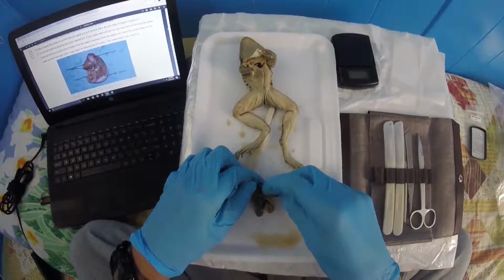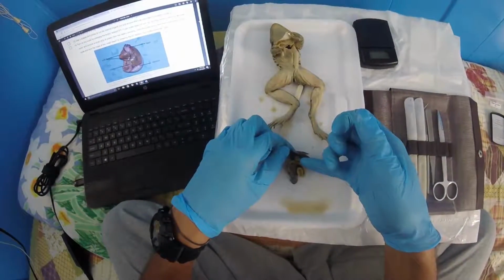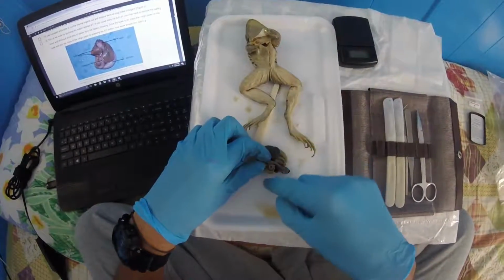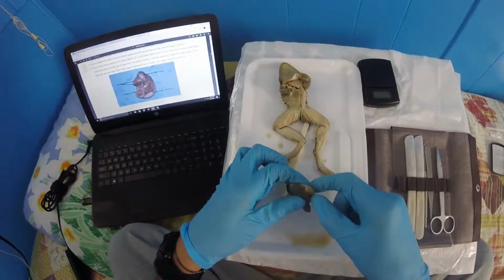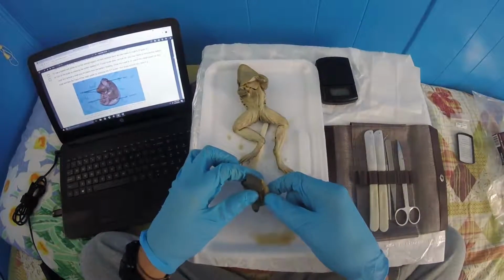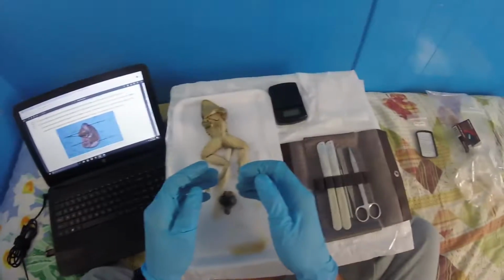The heart, I would imagine, is this little piece right here. The intestines, of course. All the intestinal tracts. And the stomach of this frog.